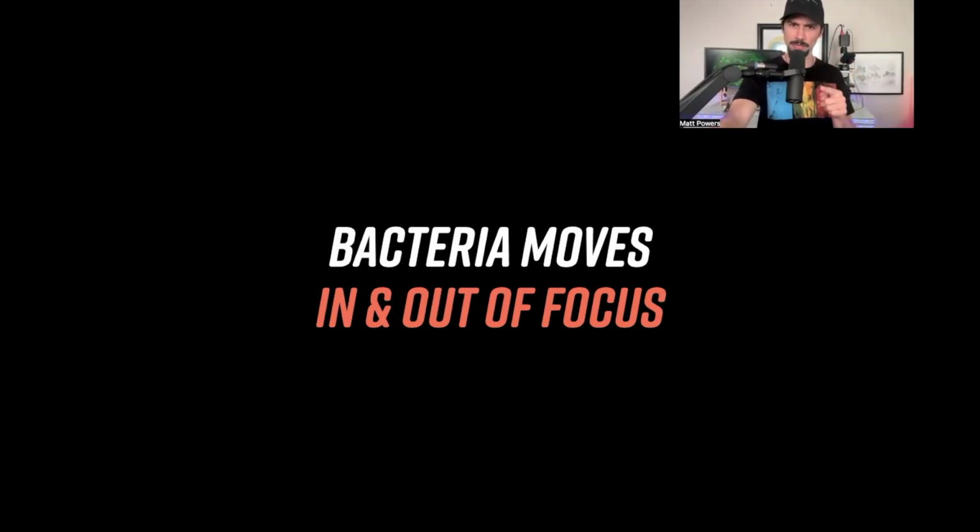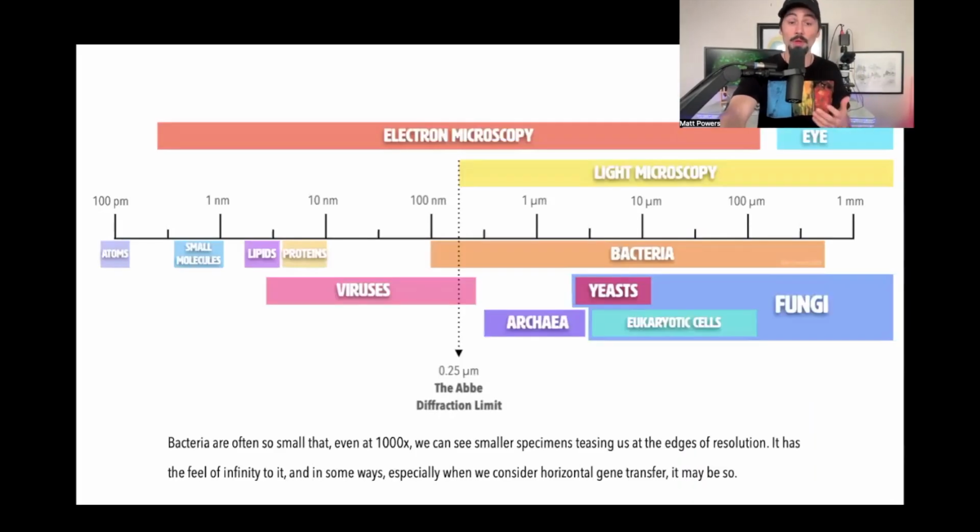Is this one I was just looking at? It went out of range, now it came back. So it's going to swim in and out of range. There are also things that are too small to see. The highest resolution you can go is 1,000x. The sharper you go, like a 4K, that's what this is, you begin to see that it's all teeming right there at the edges of our vision.